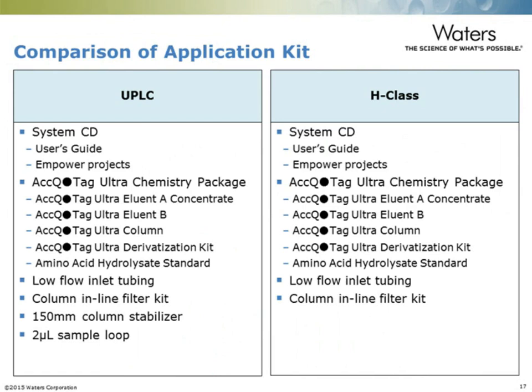The application kit used for the two instruments is essentially the same. With the UPLC, you have a couple of hardware changes because the column heater and the injector mechanisms are different, but all of the chemistry and all of the results can be expected to be the same.